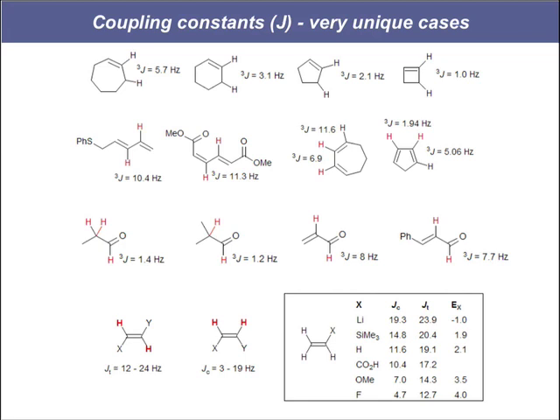But if they involve sp2 hydrogens or there's some chirality going on, check these slides to make sure that they don't have different coupling constants. And I'm going to show you in a minute what we do to compensate for that.